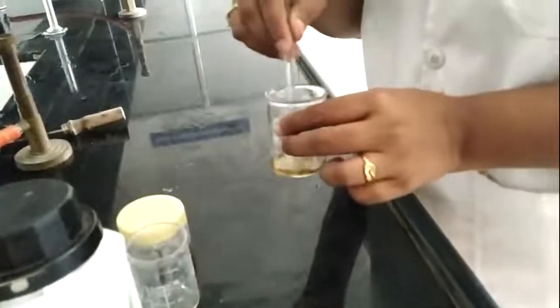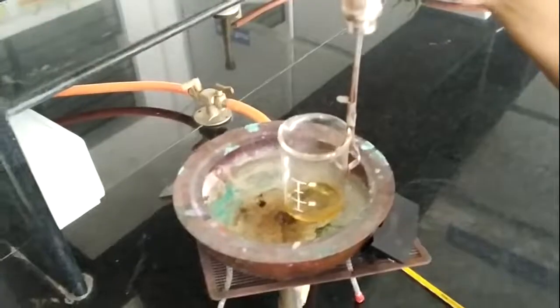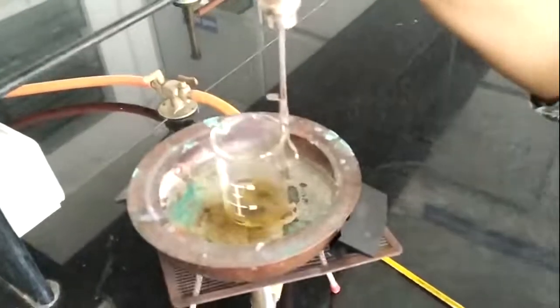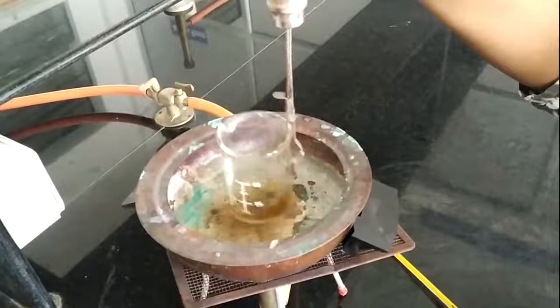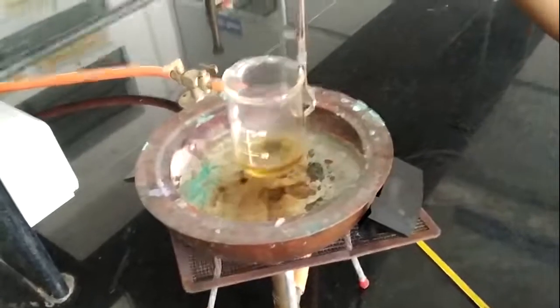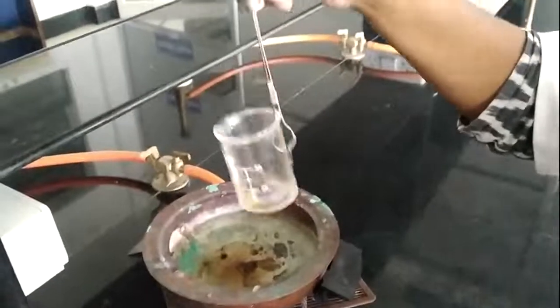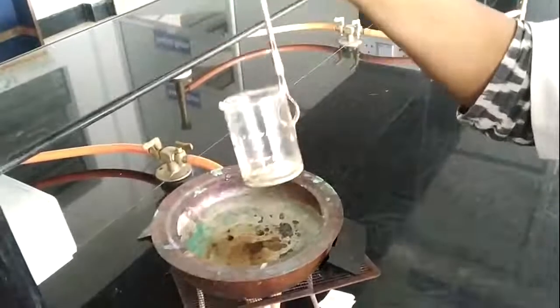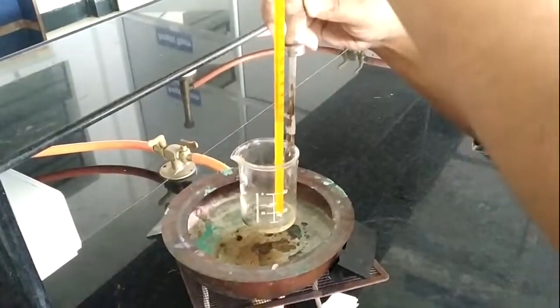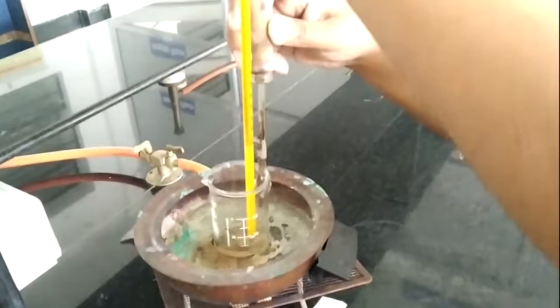So now we will proceed to the heating part. Now I am proceeding to heat this iodine solution, and we will heat it till the brown color disappears. Now the brown color is almost going to disappear, and I again measure the temperature. It almost reaches 50 degrees Celsius.